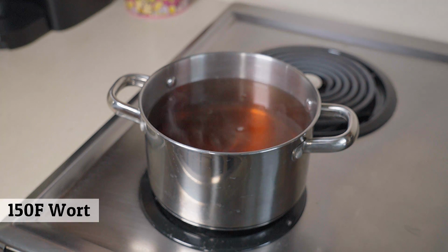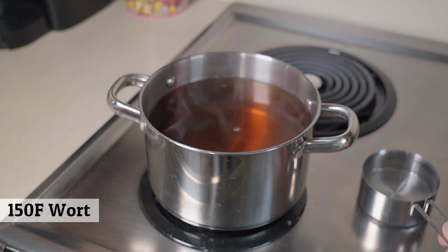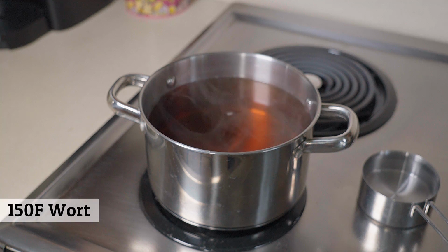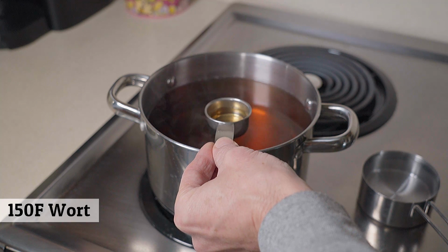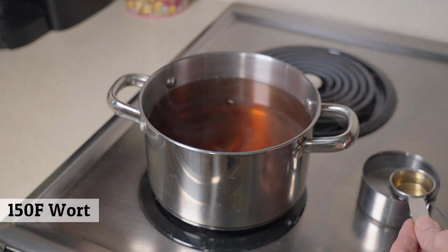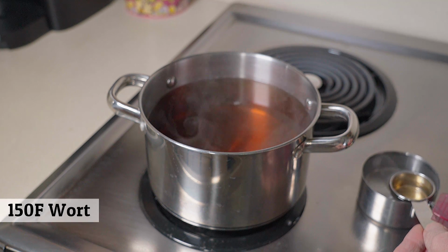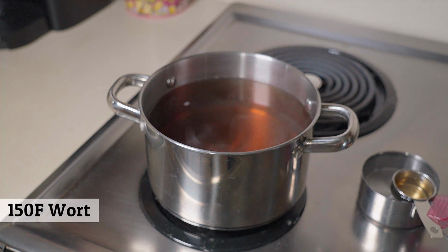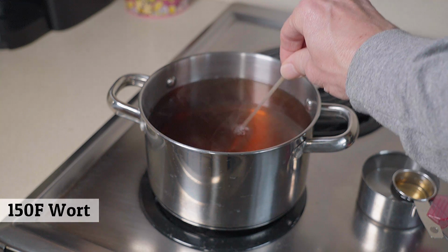Throughout these tests, I'm also going to do a parallel version of just cooling the wort sample by itself and then taking the reading, just to give a comparison. So I just dip a little bit out, and I'm going to place it in the chilled water to bring the sample down to 75 degrees-ish, to represent a room temperature cool down. First, we're going to take the direct sample.